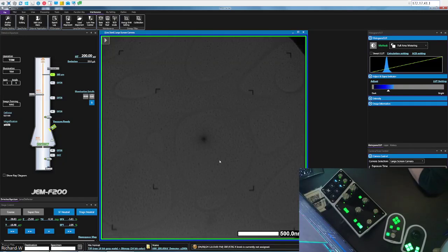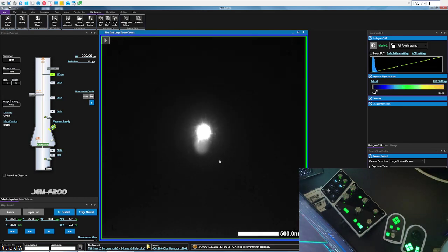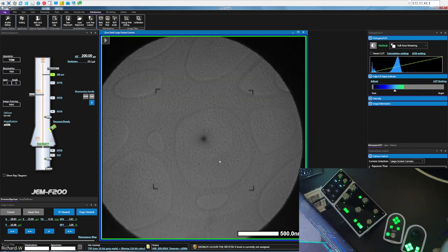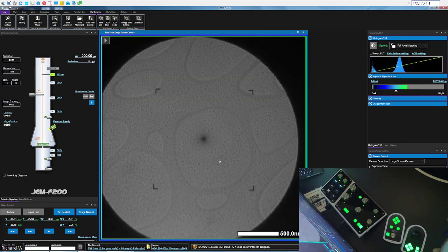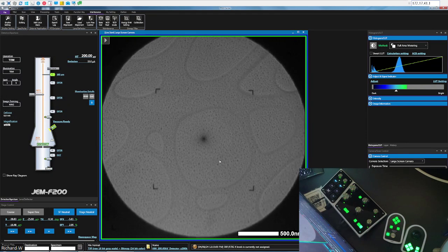So aligning for high resolution TEM, like I said, we've already done the condenser lens aperture. So we can shift the beam to the center, which is here, and check the condenser lens aperture is nice and standard. Maybe needs a slight touch up, like so. Okay.